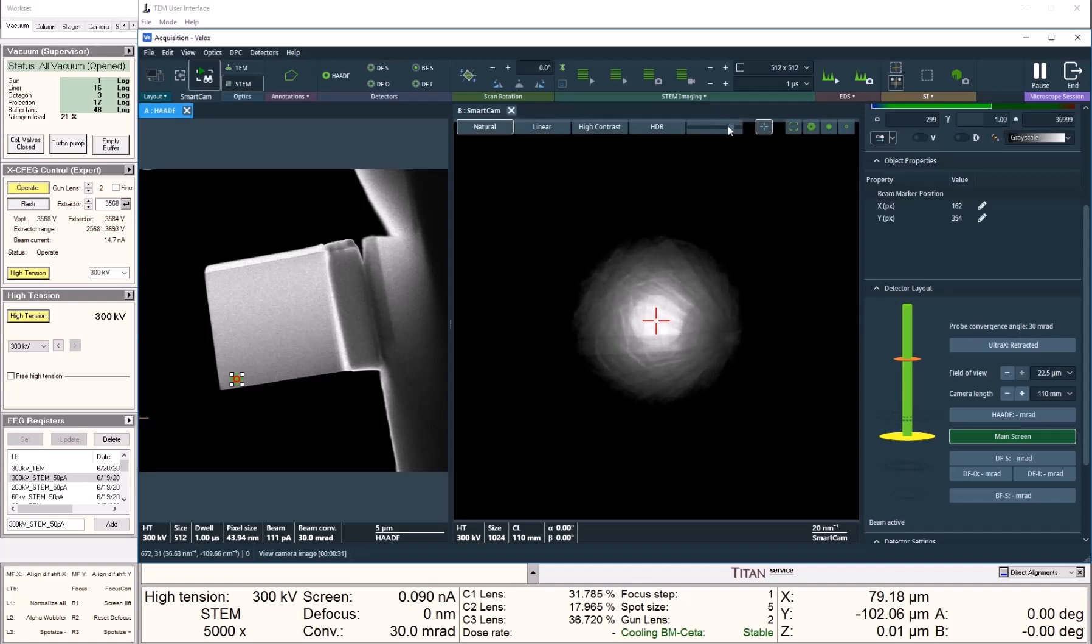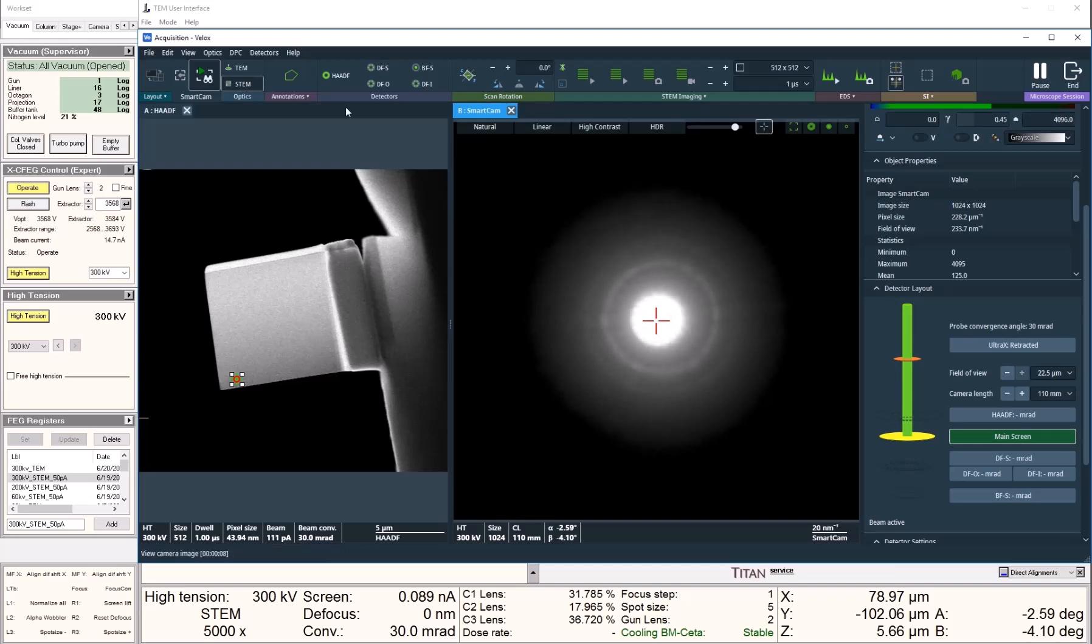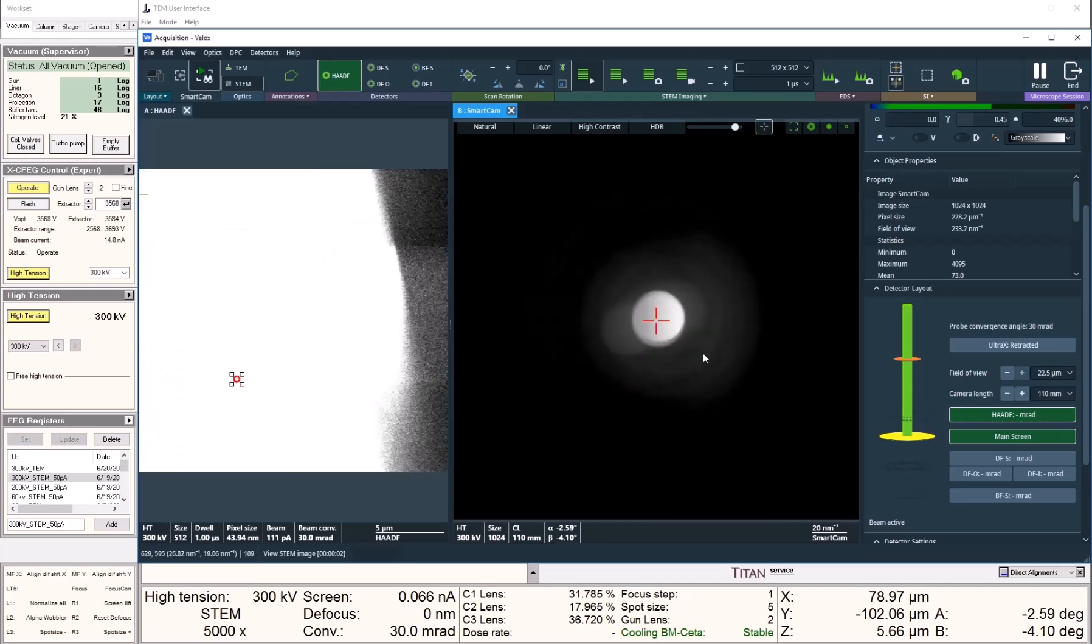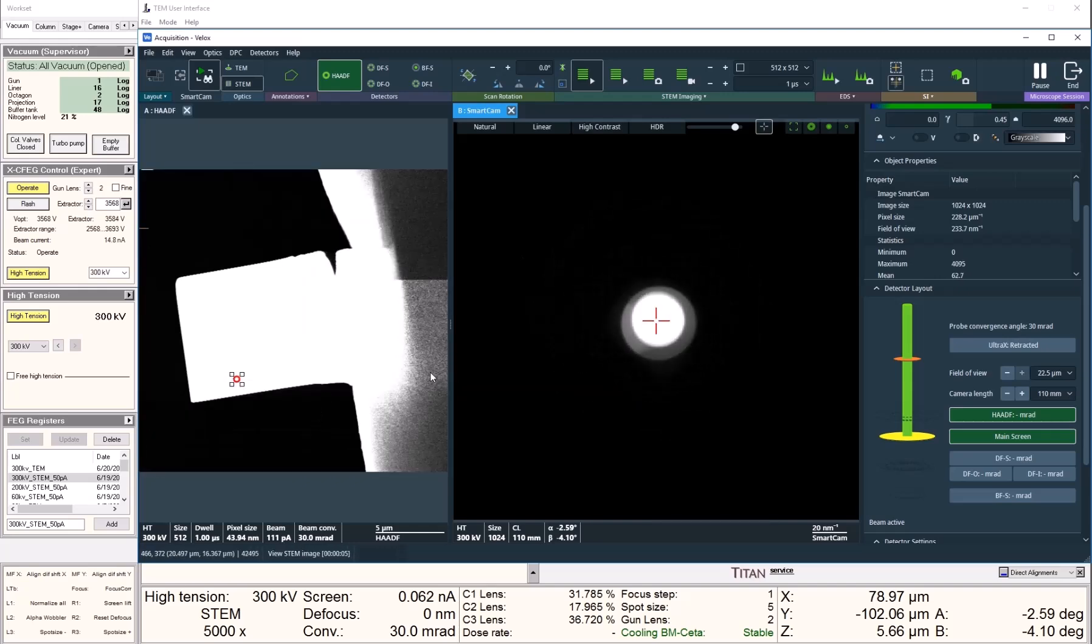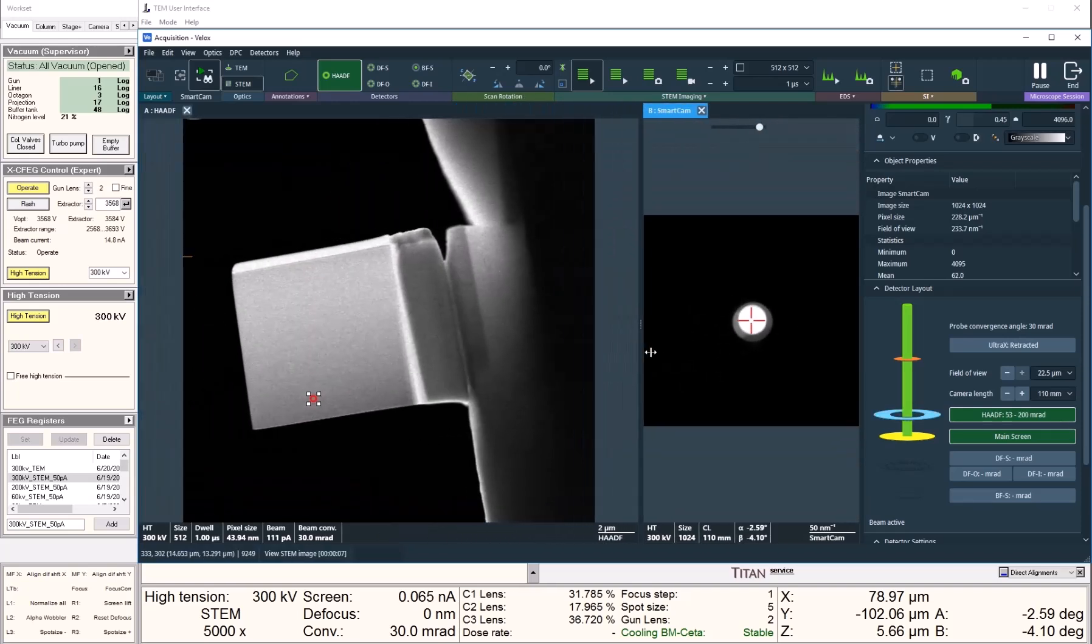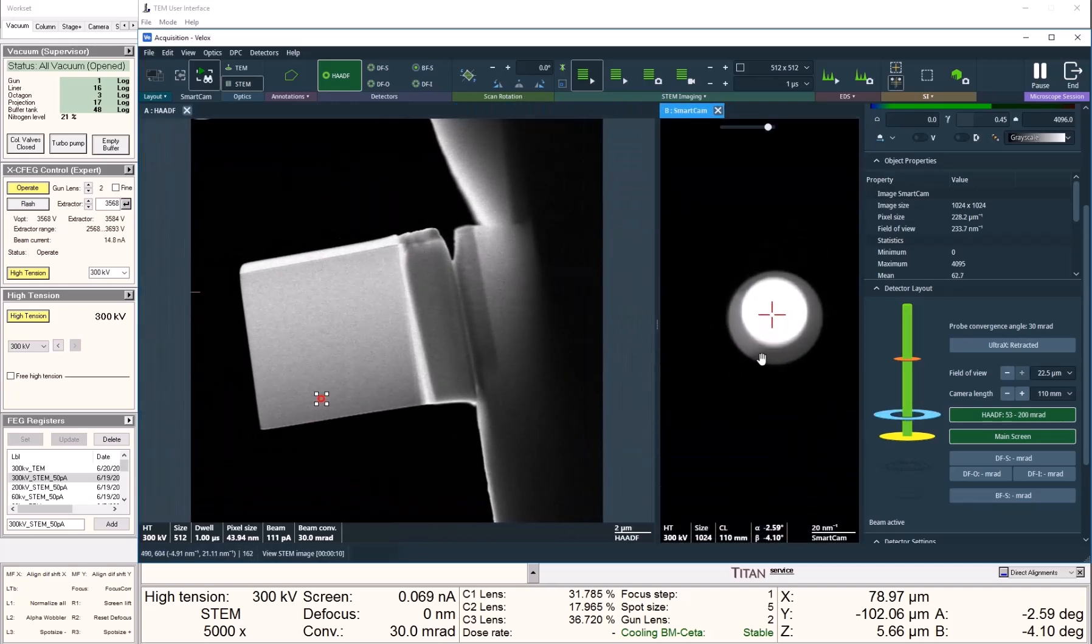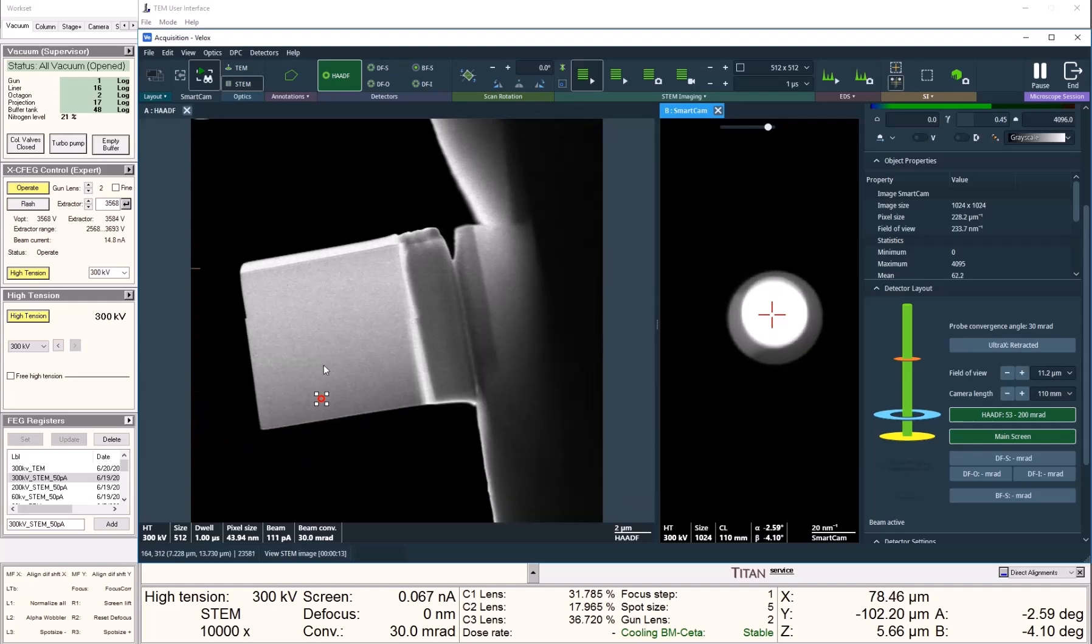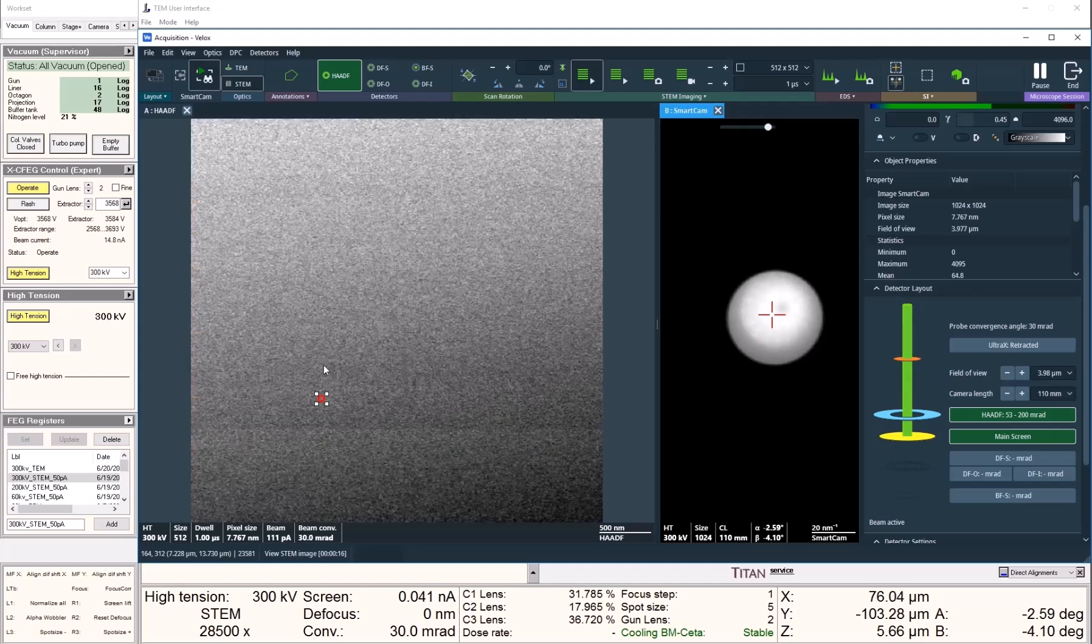Now I simply double-click on the zone axis center and VLOG would tilt the sample for me. We can zoom in to the sample and verify that our region of interest has been nicely aligned to the zone axis.